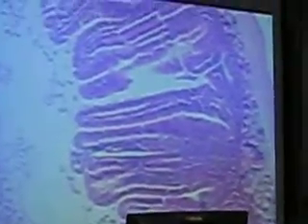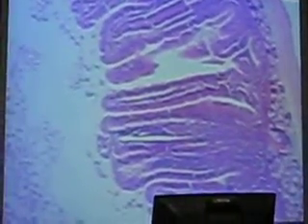Okay, so in the intestine, we're talking about simple columnar. It's non-ciliated, but it has a lot of microvilli. And so you really won't be able to see the microvilli, even if you go all the way up to high power. You might see a fuzzy surface or a slightly thick surface. That's just the microvilli, called the brush border on here. So you're going to be identifying the epithelium as simple columnar epithelial tissue.